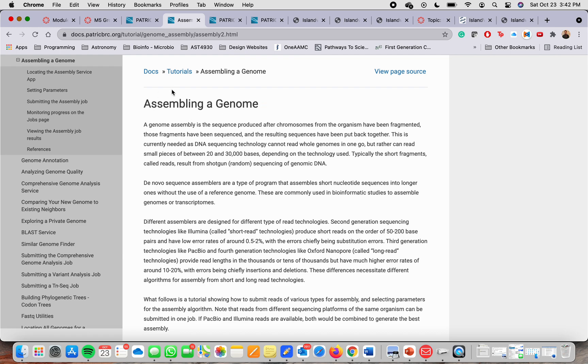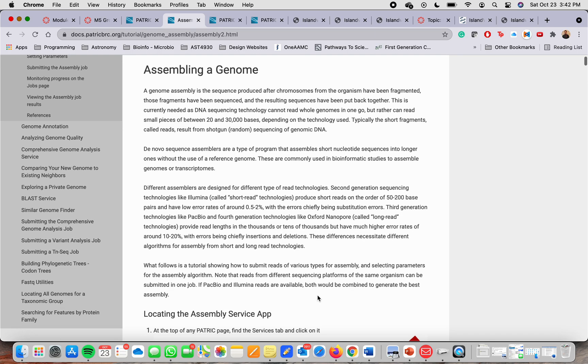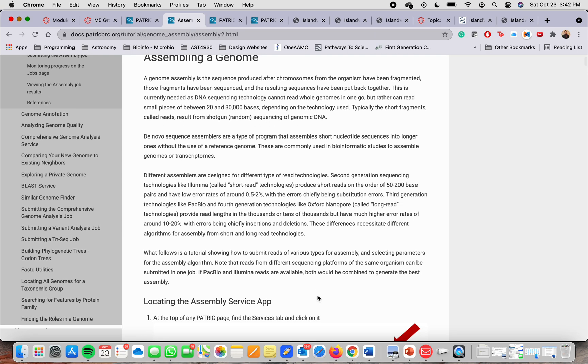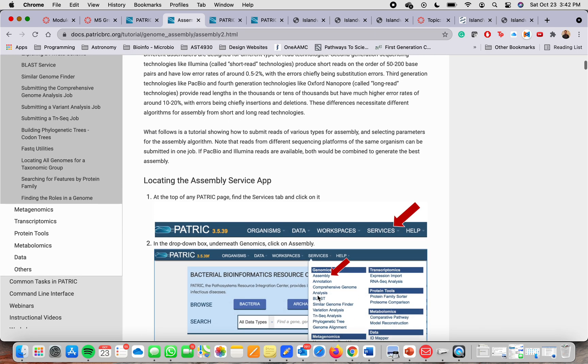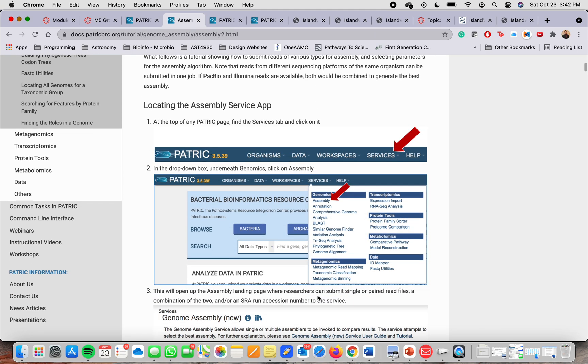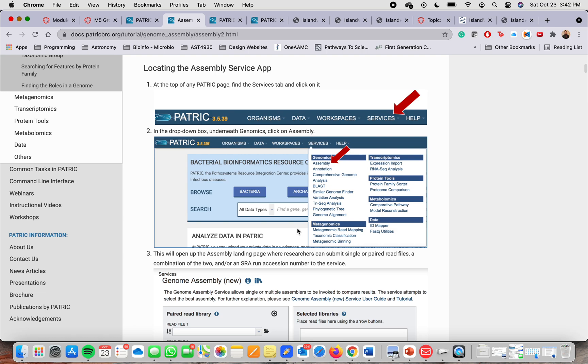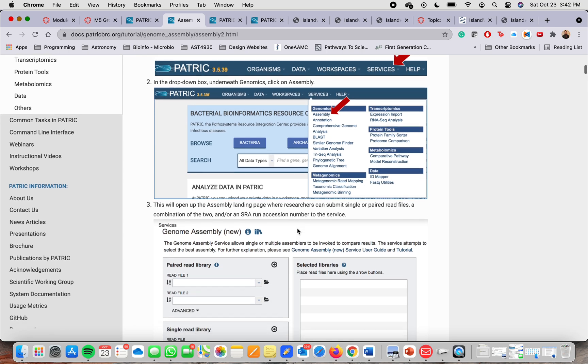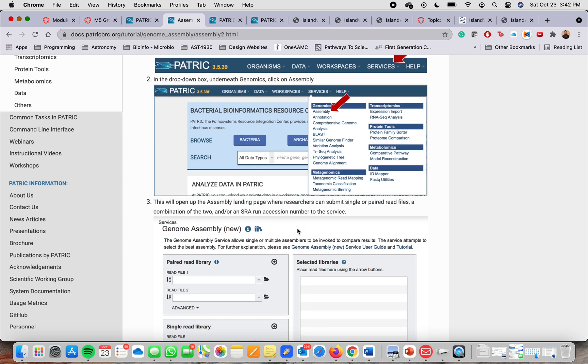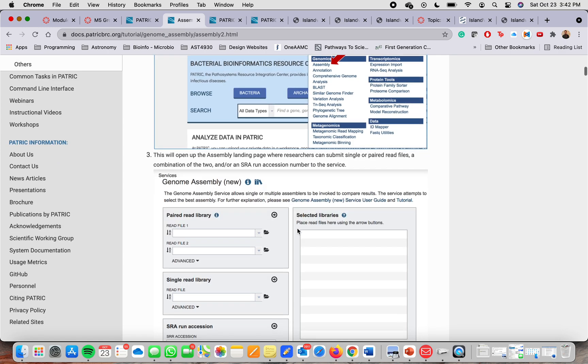For example, this is how to do genome assembly. And it will give you description of that. It will tell you how to locate the assembly service app. And it will walk you step by step how to do it.